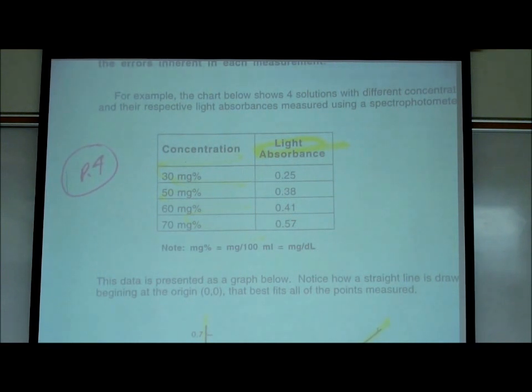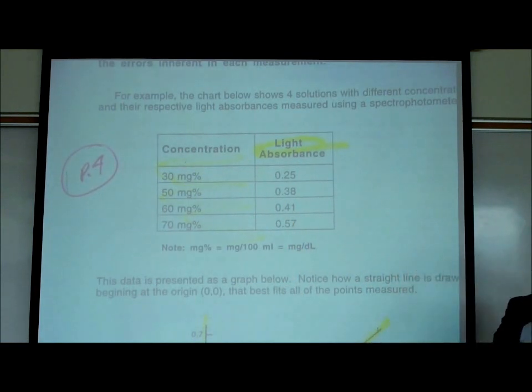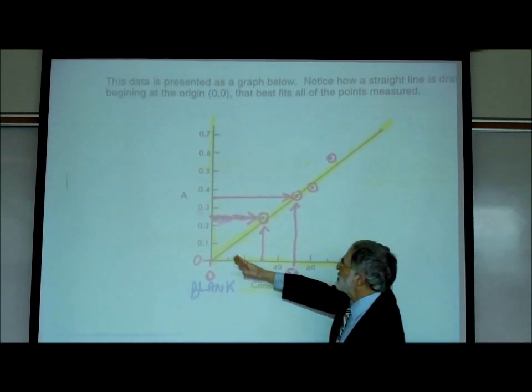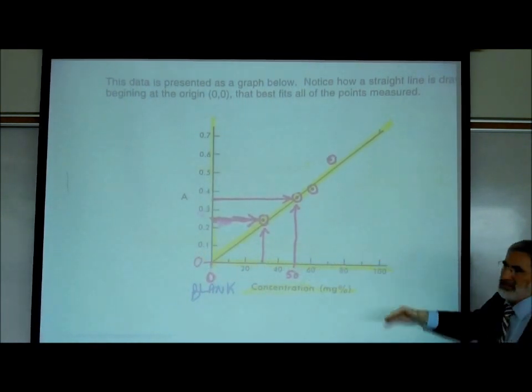All right, now we take this data and graph it. And that's what you're going to be doing. You're going to be graphing. So here it just shows that, literally using the data from above, we constructed a graph showing light absorbance versus concentration.